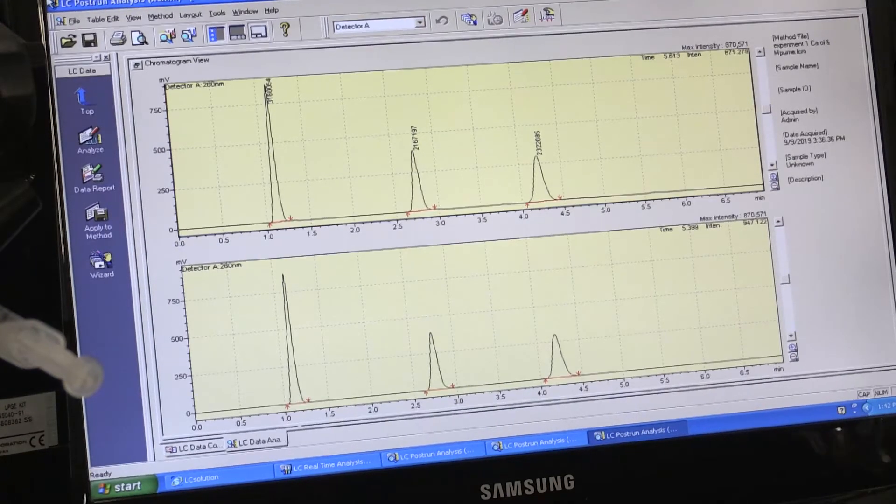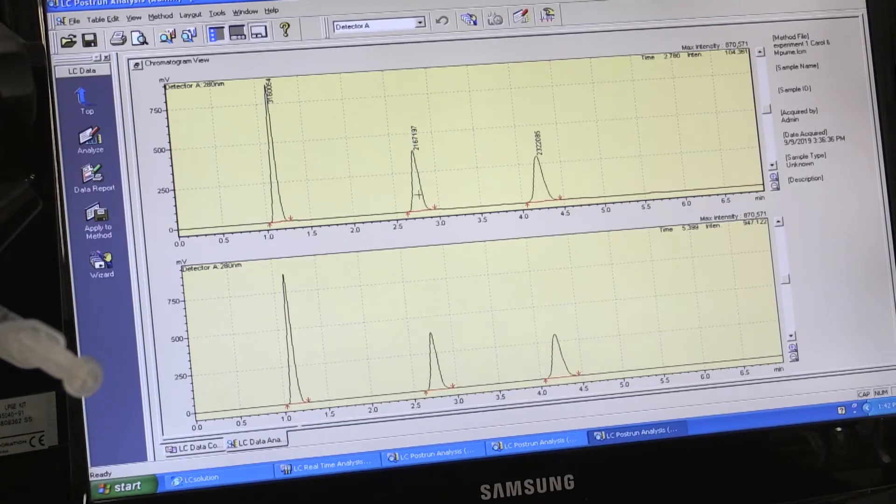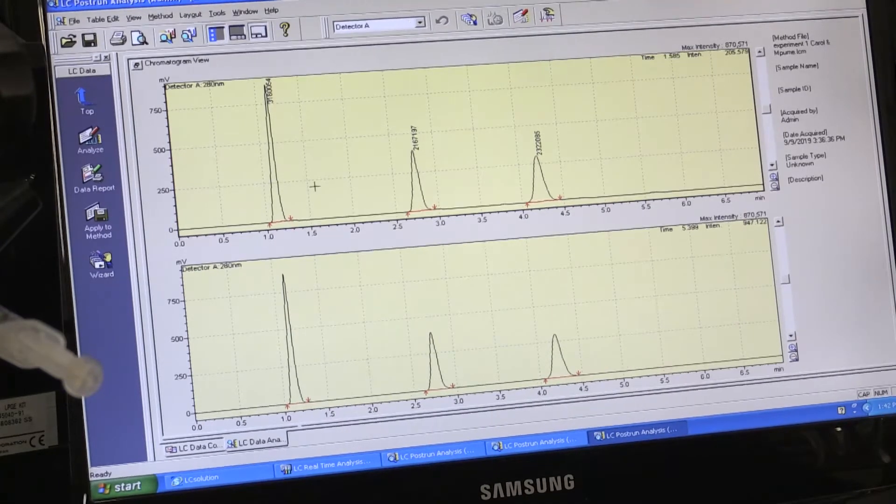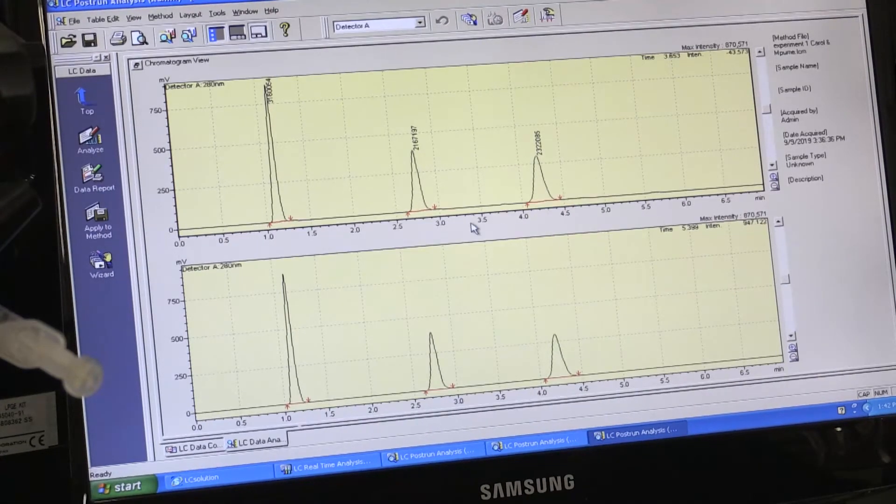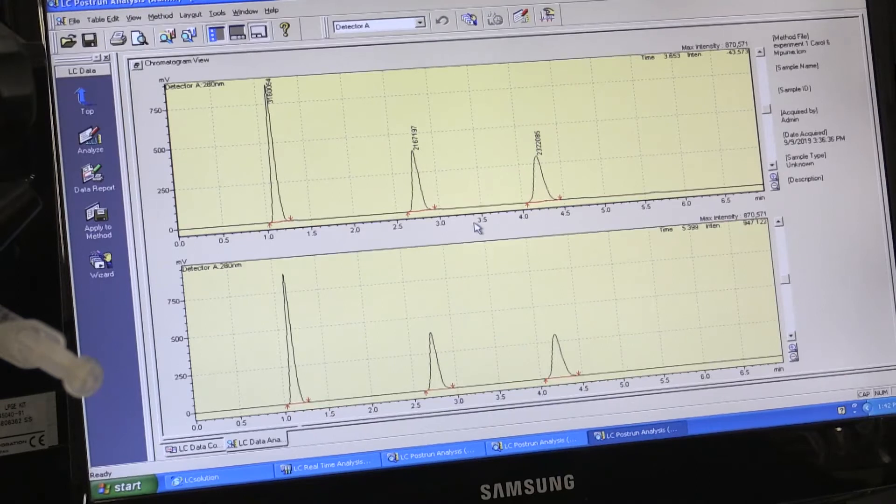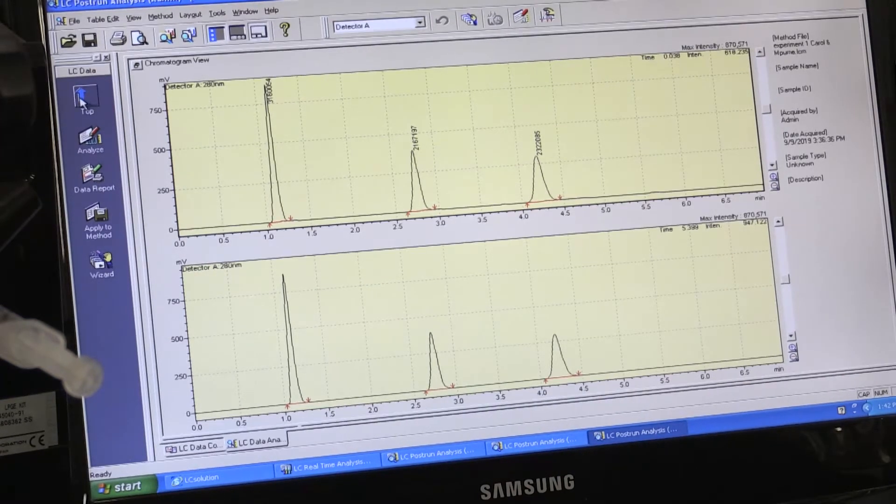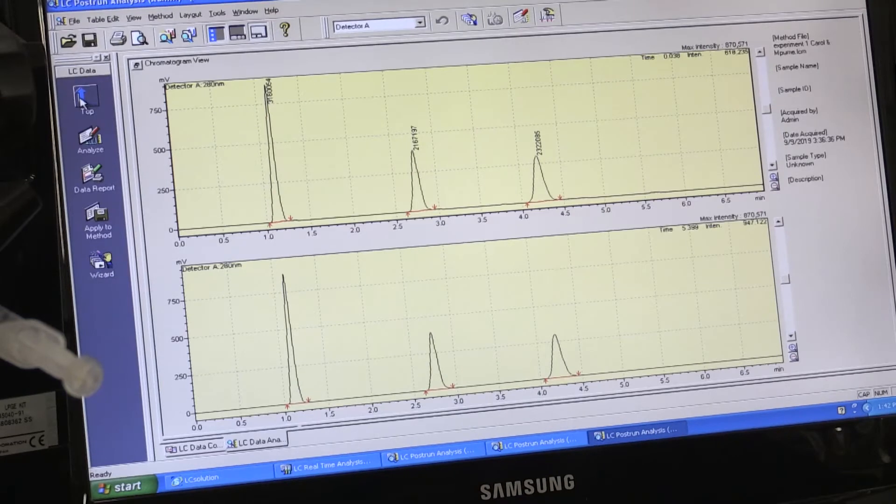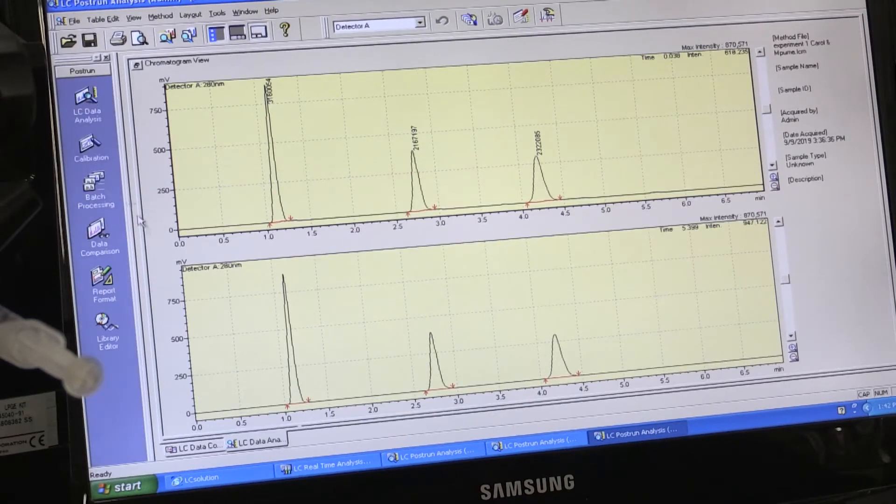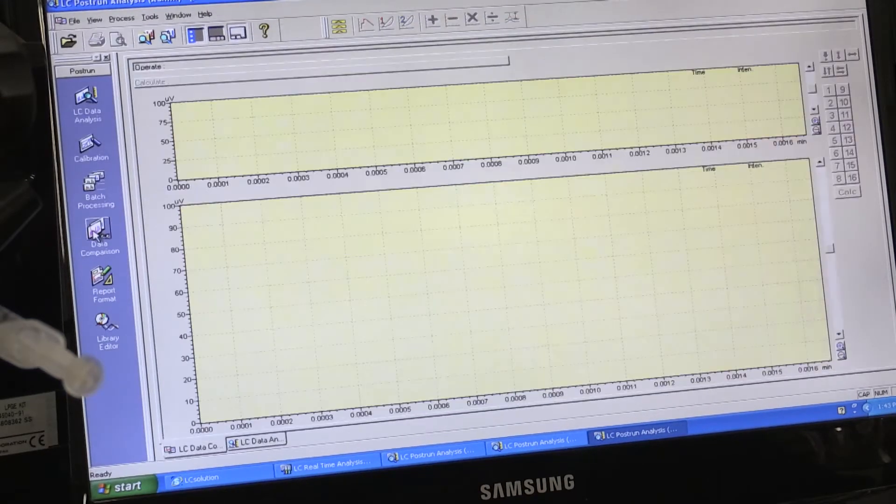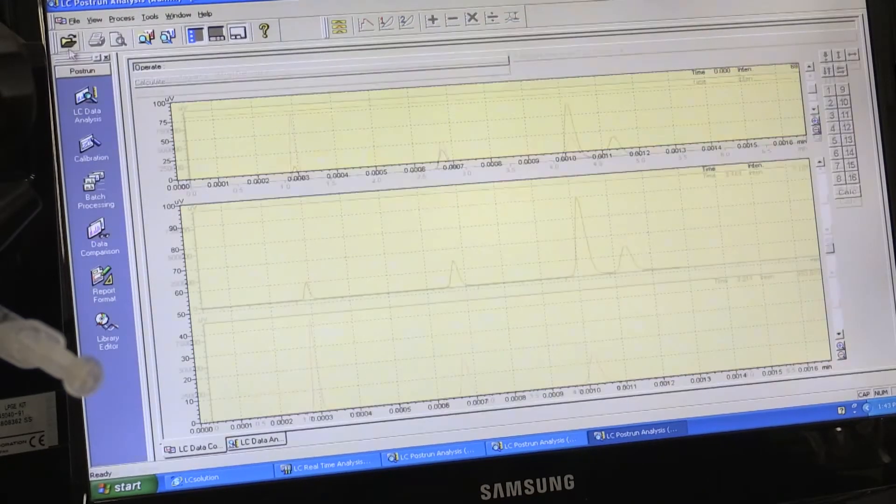In order to identify whether it is peak 1, 2, 3 or 4, we will compare this to the chromatogram at 254. I will use the software to show you this.